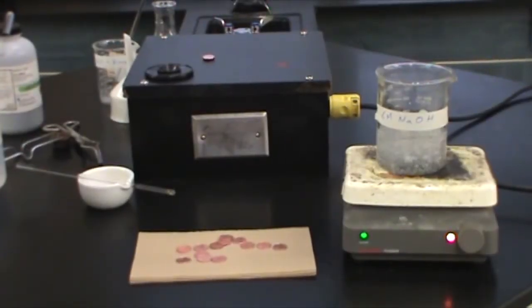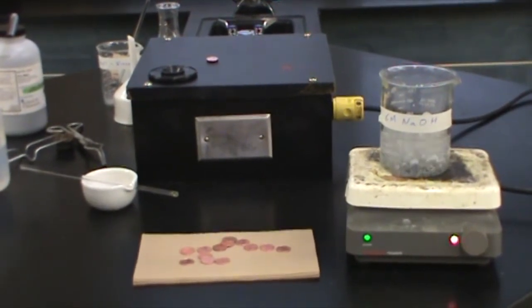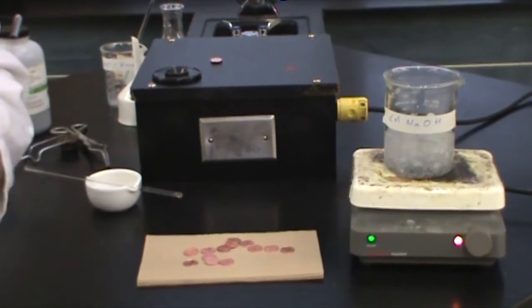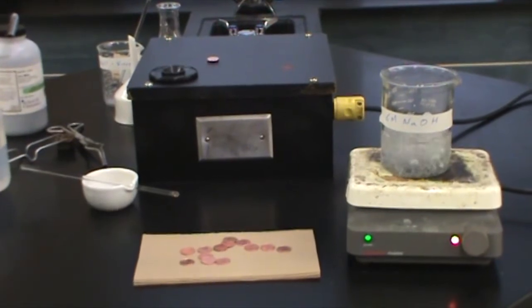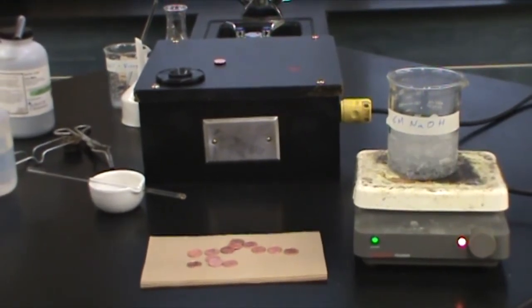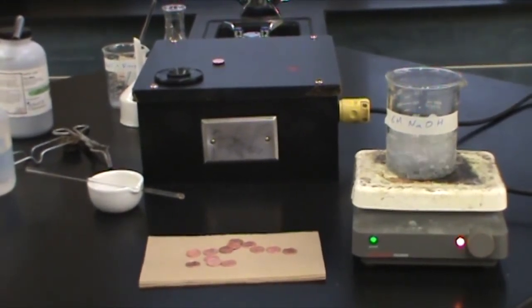The next step is to add our pennies to the solution, making sure they are in contact with the zinc powder. Here the zincate ion will reduce to solid zinc which will collect on the penny and coat it.